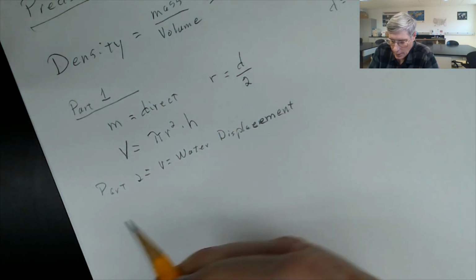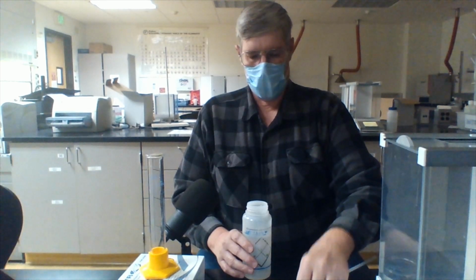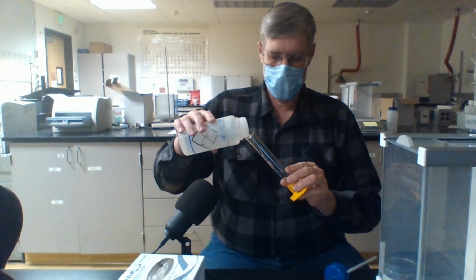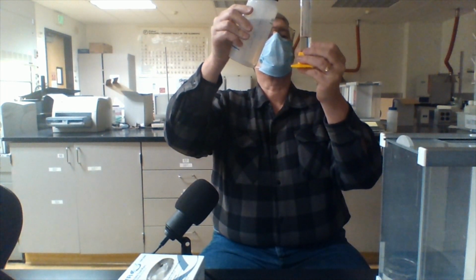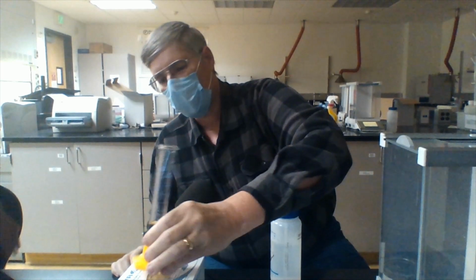Sorry, I'm writing too fast. And that will conclude the use of these metal cylinders. All right, we will now use the same 3 metal rods, and this time we're going to calculate the volume by water displacement, or what we call volume by difference. First thing we need is to place a fixed amount of water into a graduated cylinder and record the initial volume. In theory, when you add an object into water, the object will displace a volume of water equal to its volume. So our first measurement will need to be, what is the volume of the water initially?